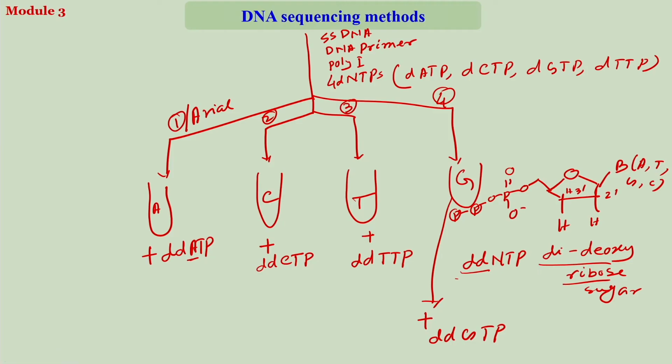So, there was another trick, that is, Sanger has labeled this phosphate with a radioactive P32 element on the ddNTP. Nowadays we do not use radioactive labeling, most often we use fluorescence labeling, and that is done on the nucleobase, not here. So anyway, be it the radioactive label or the fluorescence label, the labeling was done on the ddNTP, all of them.